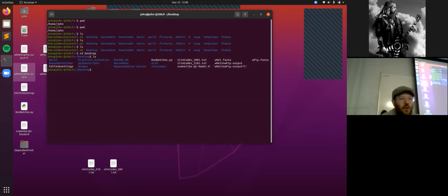And if you ever have a question about it, the best resource is just Google. Just Google, oh, I need this dependency, how do I install it? It'll literally give you a line of code that you can type into the command line, and then you hit enter, and typically it'll install it. So just know that that's going to happen. Don't get frustrated. One of the hardest parts as a beginner is literally just the first day of trying to get whatever you want running. That's the hardest part.